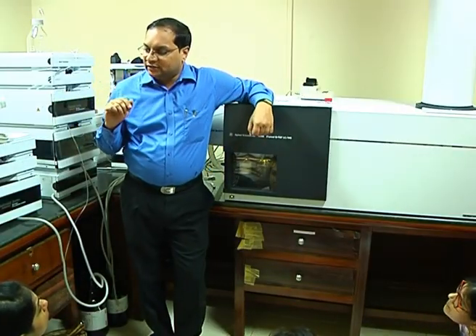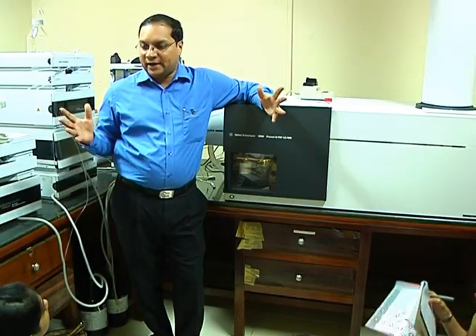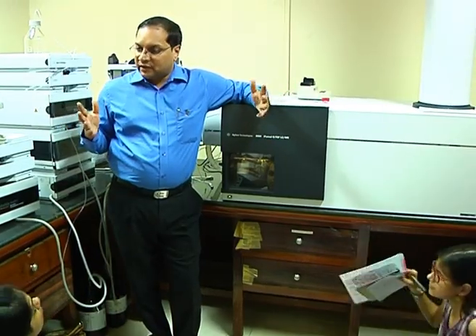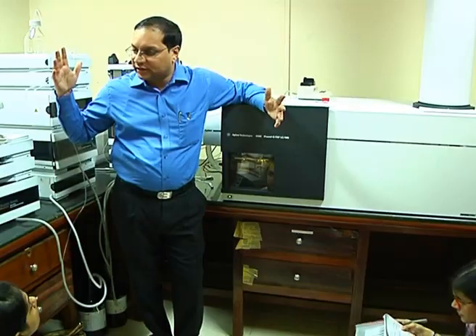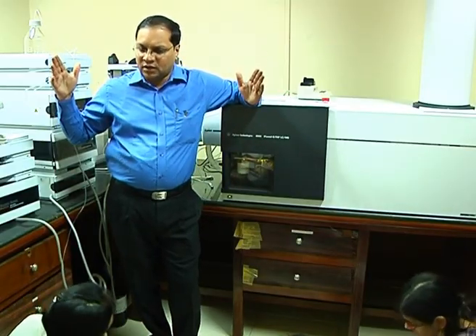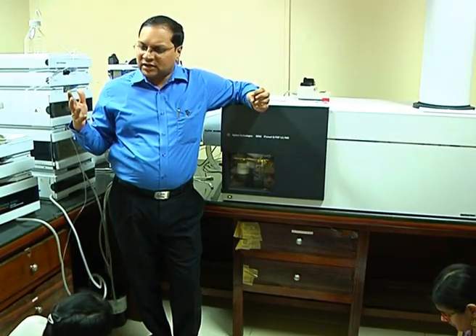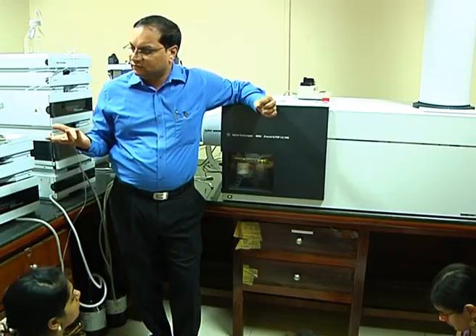In MS only mode, let us say this machine has the capacity to scan from 5 m/z to 3200 m/z. That is the range of the machine. But I know my peptides, which are doubly charged, cannot go beyond 1200 maximum.